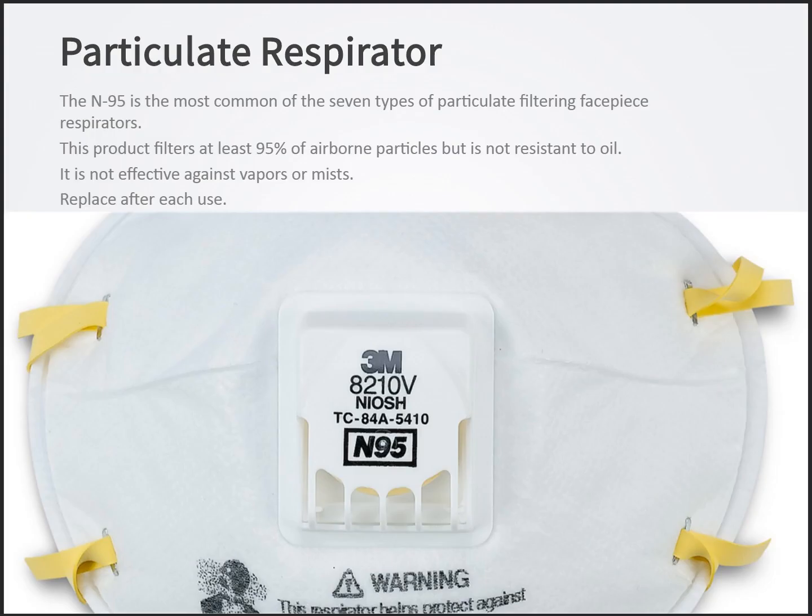The particulate respirator. The N95 is the most common of the 7 types of particulate filtering facepiece respirators. This product filters at least 95% of airborne particles, but is not resistant to oil. It is also not effective against vapors or mists, and should be replaced after each use.